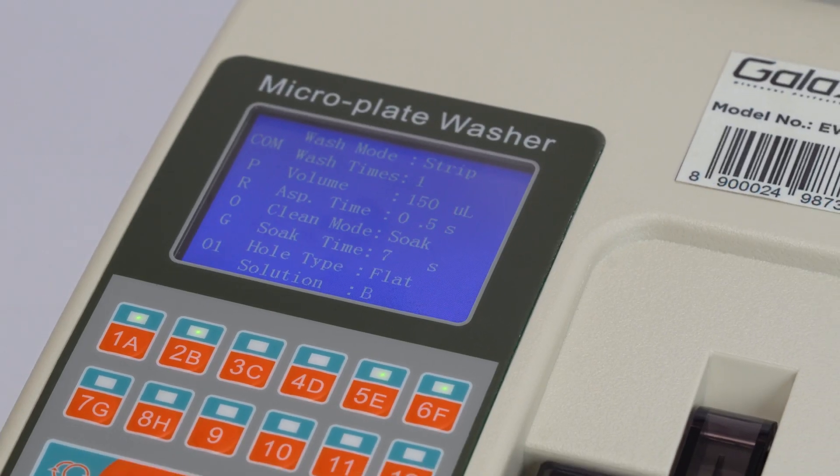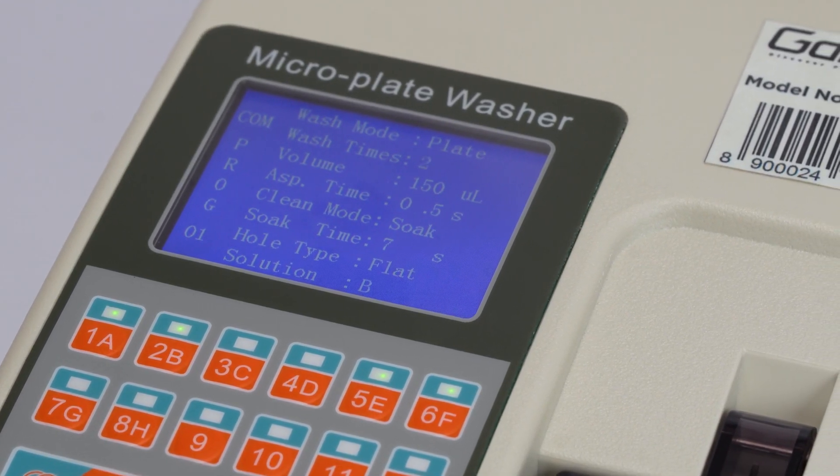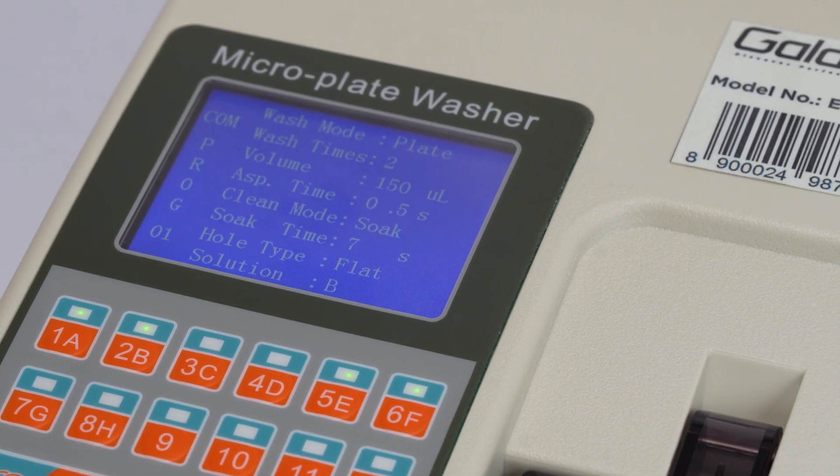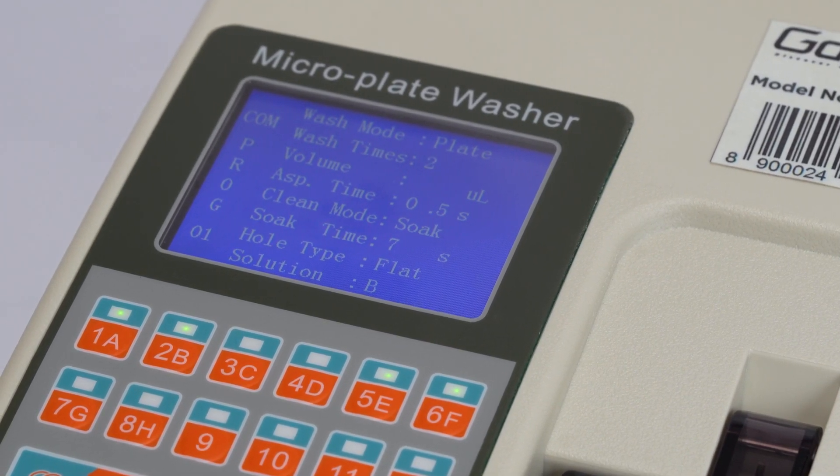Configure the washing program, washing mode, and strip plate settings. Set washing times from 1 to 99 selectable. Choose dispensing volume from 50 to 950 microliters in 50 microliter increments.